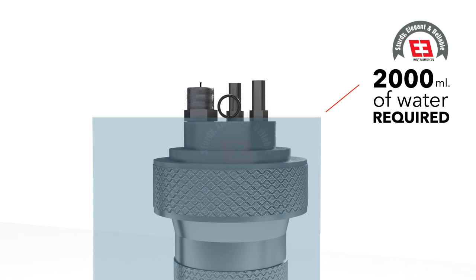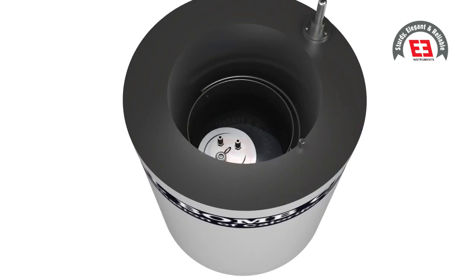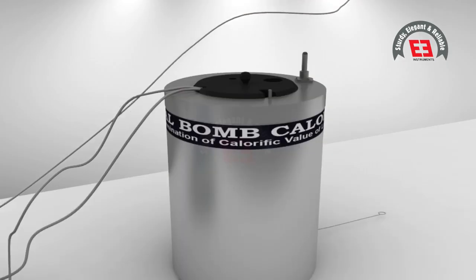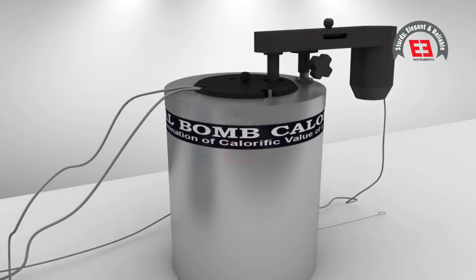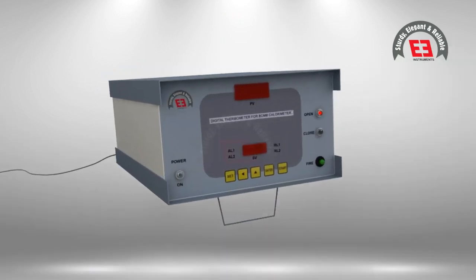Now place the bomb in the calorimeter vessel and transfer the calorimeter vessel into the water jacket of the bomb calorimeter. Put sufficient water in the calorimeter vessel to cover the flat upper surface of the bomb cap — approximately 2,000 milliliters of water is required. Maintain this quantity of water in every test. The temperature of the water shall be about 2.5 degrees lower than that of the water jacket. Connect the bomb and firing unit with the paired wire, close the cover of the jacket, and place the stirrer motor.